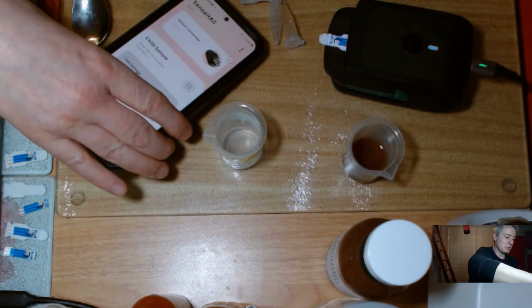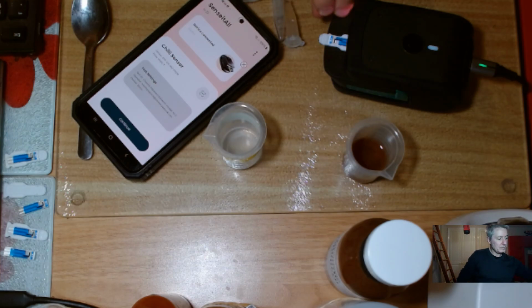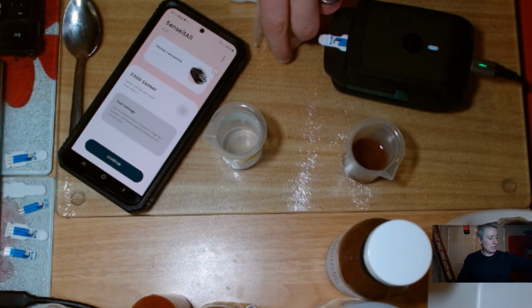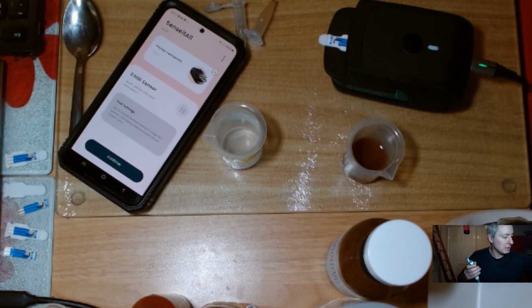Right, put that down there so you can see it. I think I put a new sensor on there. I'll just have a quick look at it. Yeah, that looks pristine. Okay. Right, so I've got my sample here. I will grab a 50 microliter pipette and put that sample on.